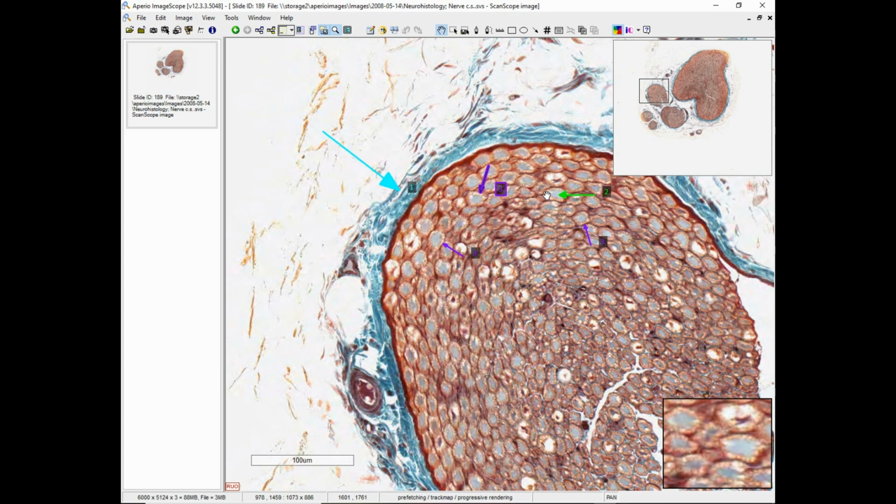2, this is pointing at that space within the myelin sheath. So that's the space within the myelin sheath that surrounds it. And then here, the purple arrows are pointing at the outer boundary. So that outer boundary is where the limit of the Schwann cells are and where we would find the endoneurium. Now, one thing that's not labeled here are the axons, but we can actually see lots of those. Any of these bullseyes in the middle of those clear areas would be examples of axons.